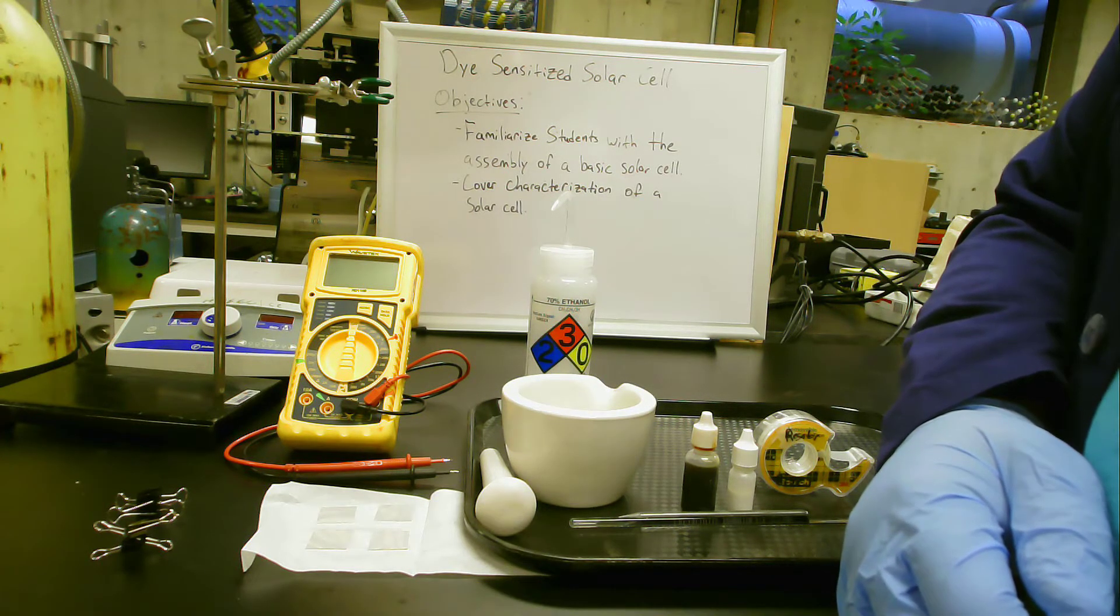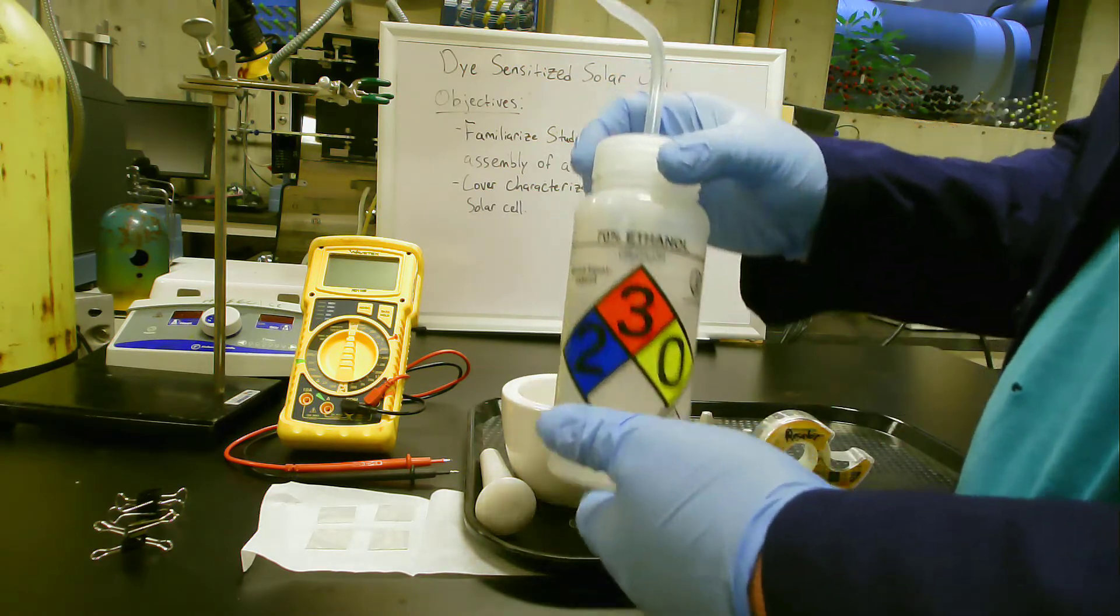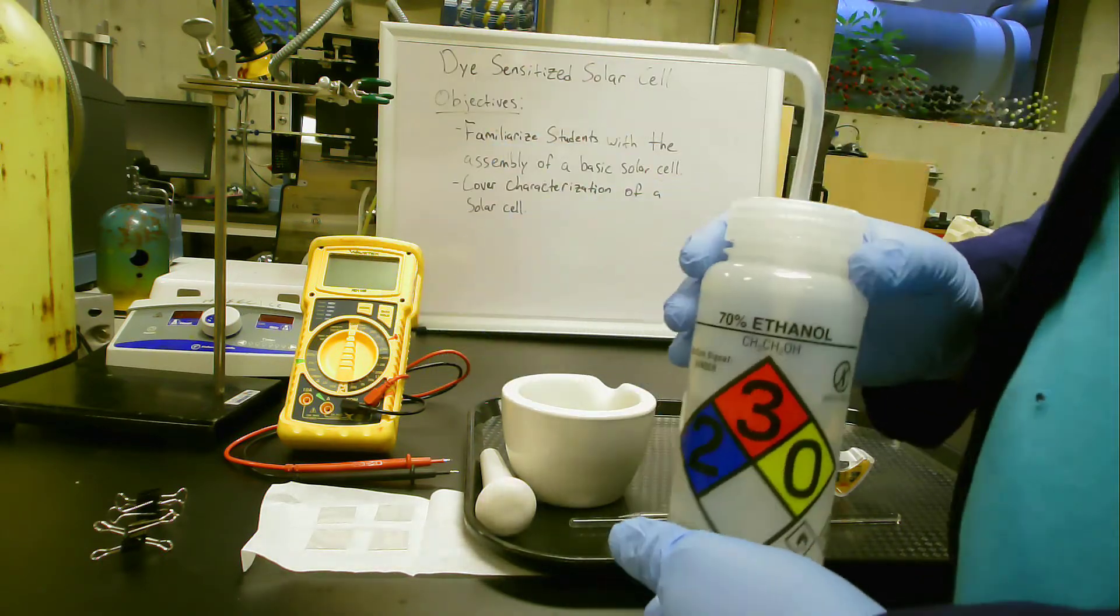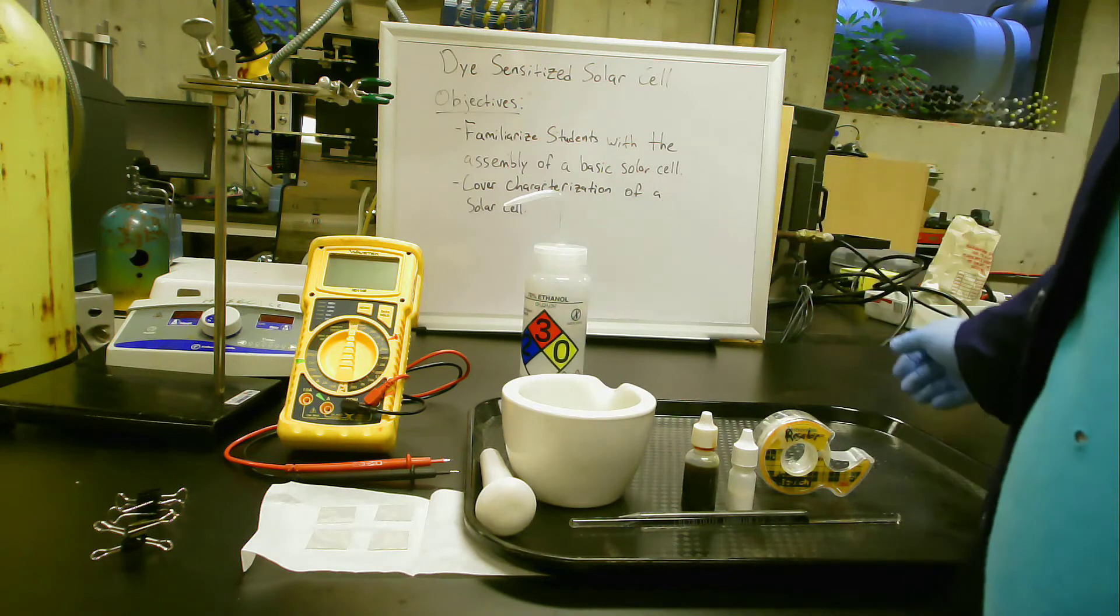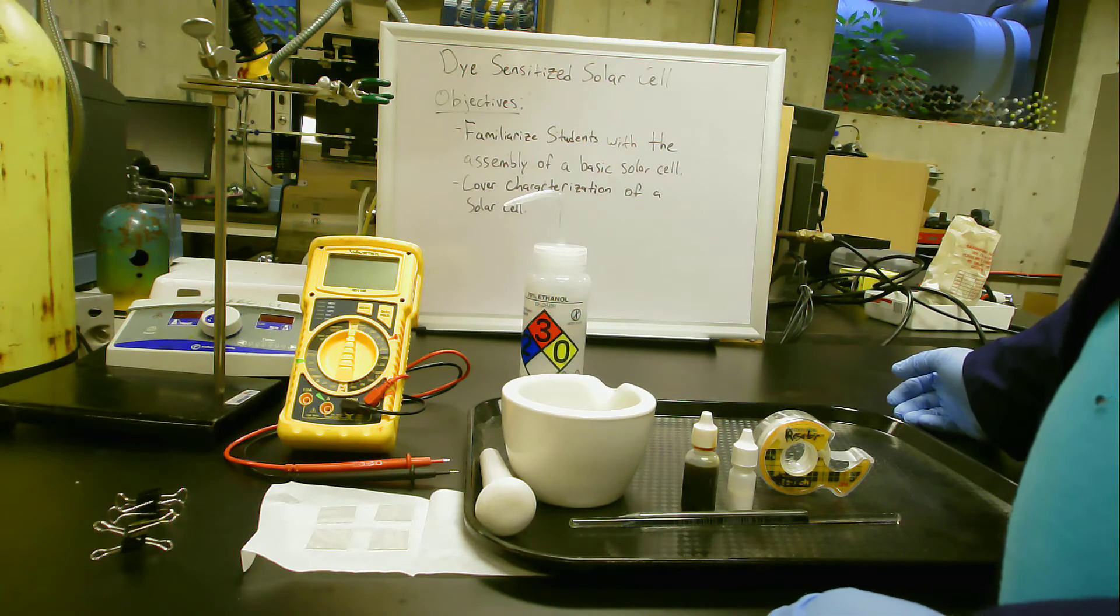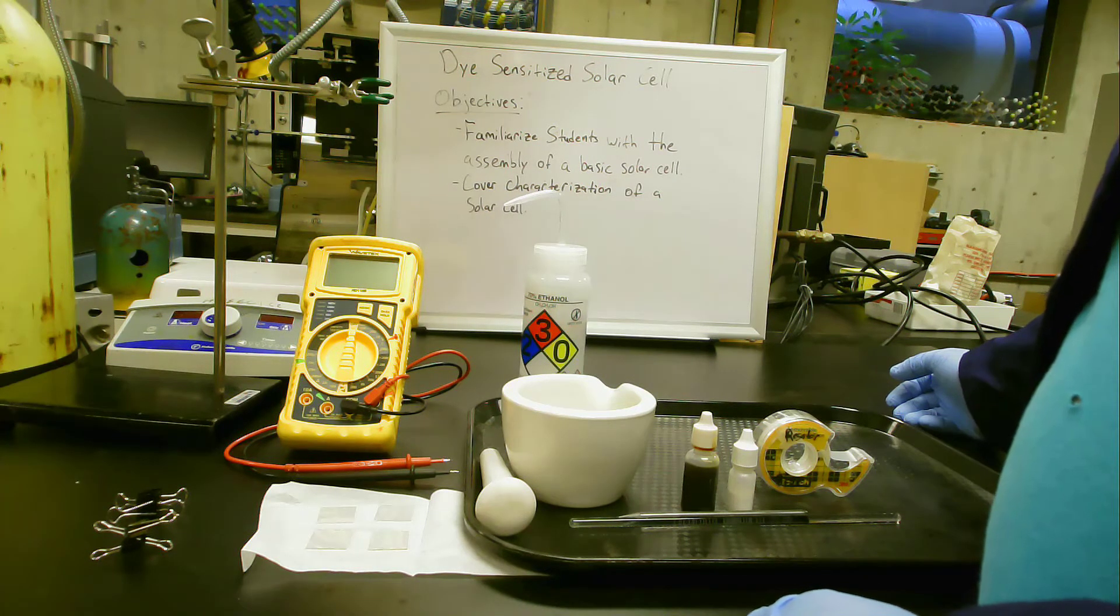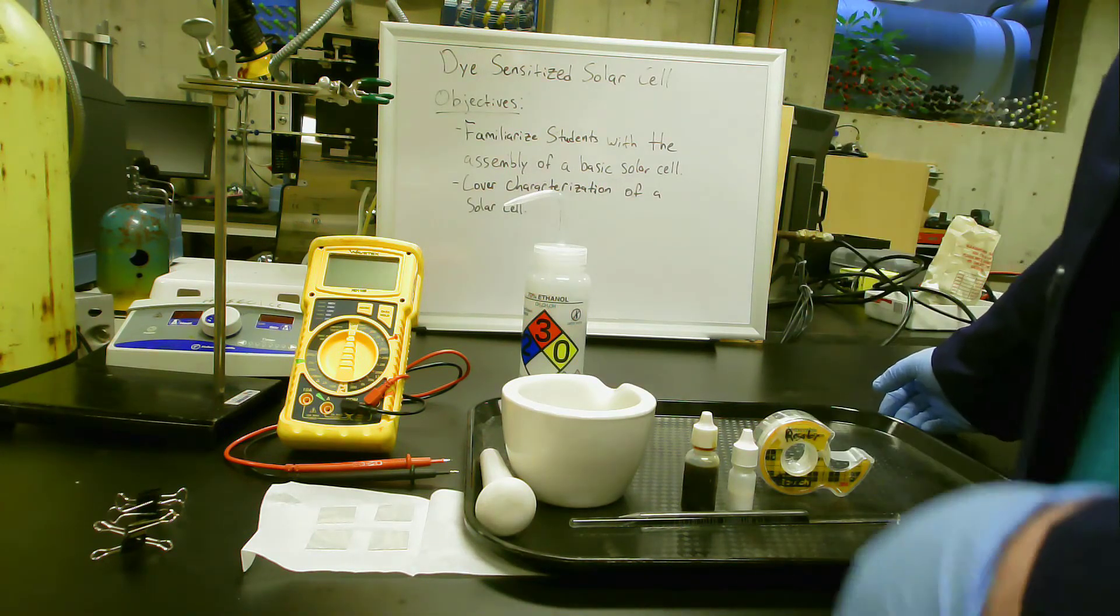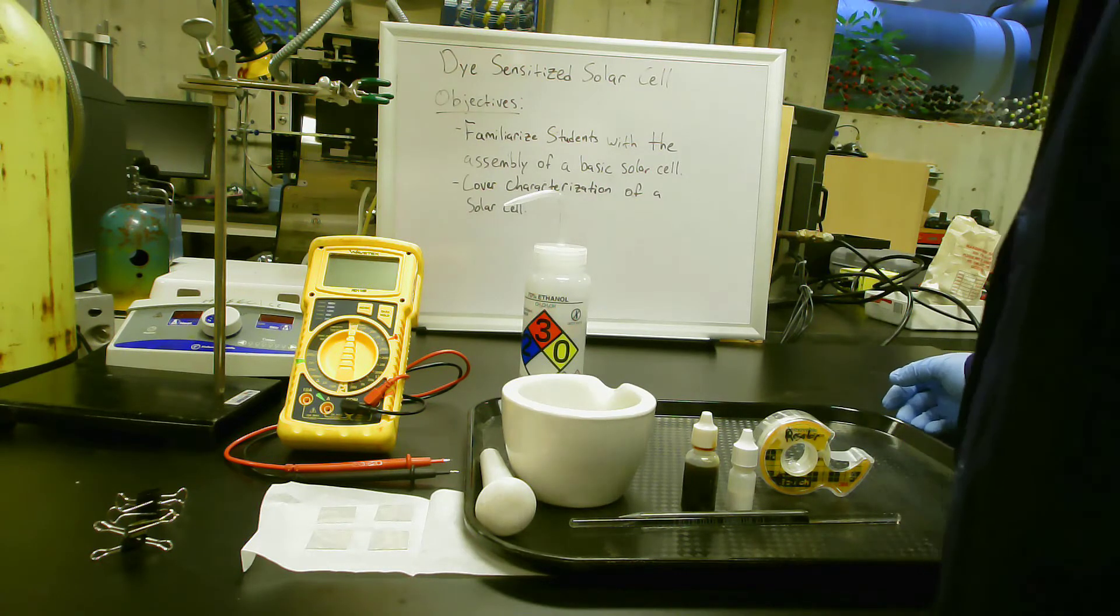We then have our ethanol, a volatile organic solvent which we use to clean off the surface of the conductive glass. We want to make sure the glass is as clean as possible, and we also want to be very careful to handle the glass in such a way that we will not contaminate the surfaces. Grab it by the sides and edges. Imagine that it's like a delicate photograph that you don't want to ruin.